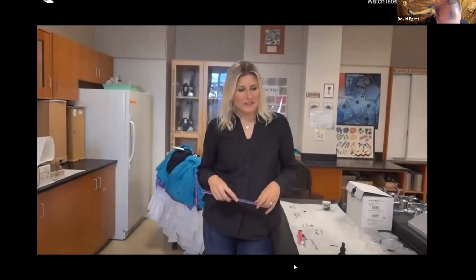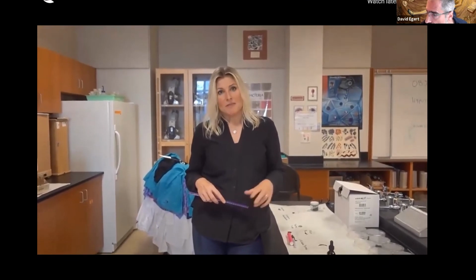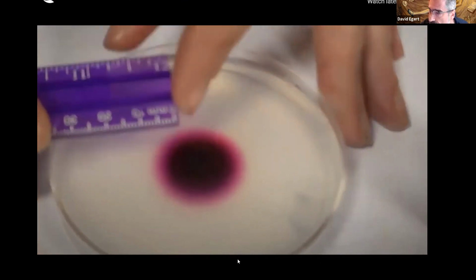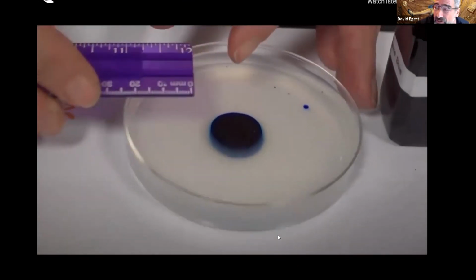All right, so we're here at our diffusion experiment, and we're going to do our time point after 1 hour. The edge of the well, and in this case, it looks like 7 millimeters for the potassium permanganate. But you can see it has not gone very far in an hour. And actually, if you just leave this here in the lab overnight, it's not even going to make it to the end of the Petri dish, because it gets slower and slower as the concentration gradient gets less as it diffuses further out.